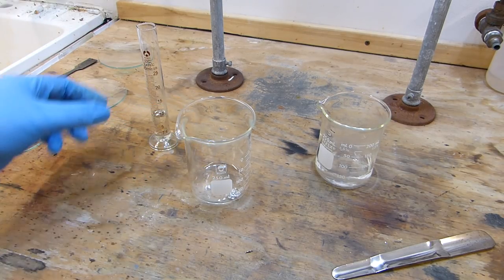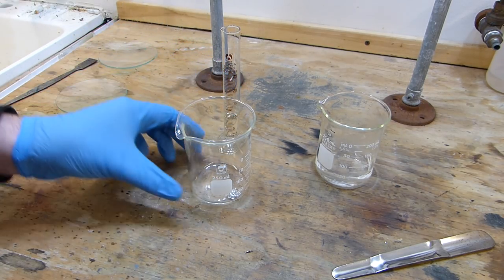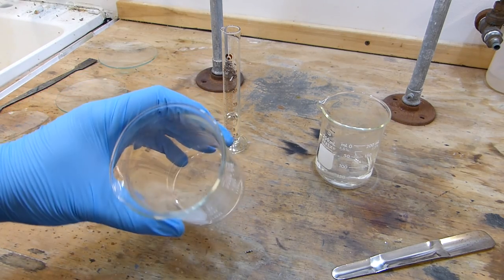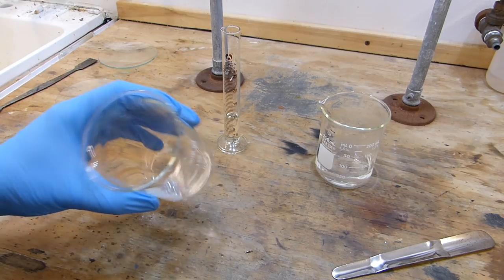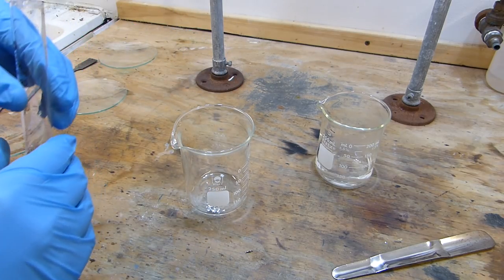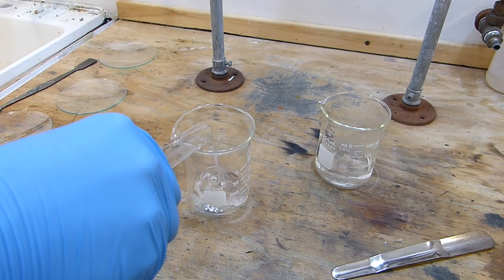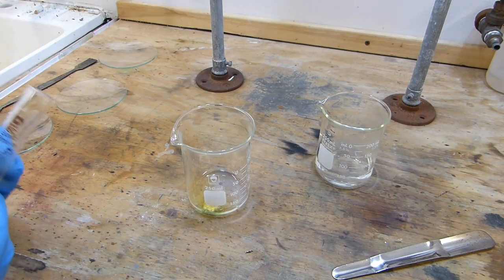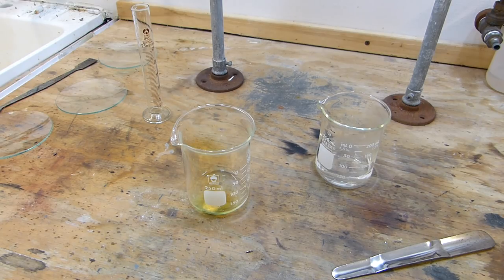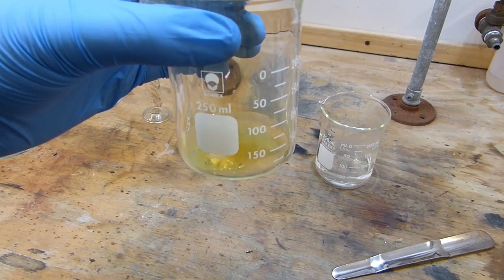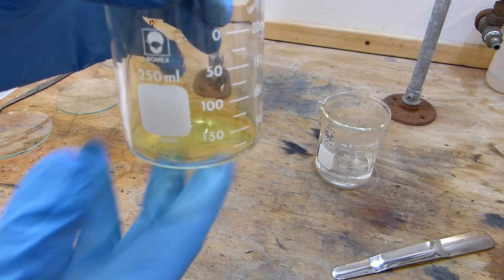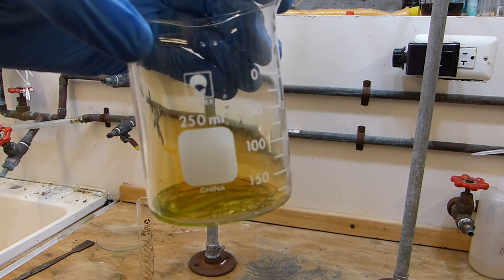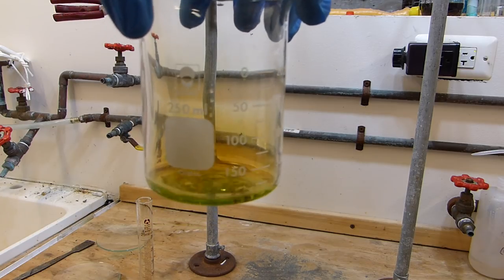All right, now for the fun part. So I'm going to add the nitric acid to this silver amalgam now and it's going to produce a lot of nitrogen oxide fumes, and that's why this has to be done either outside or in a fume hood like I've got here. And you can see the reaction immediately taking place and you can see here as it dissolves the brown gas of nitrogen dioxide is produced.